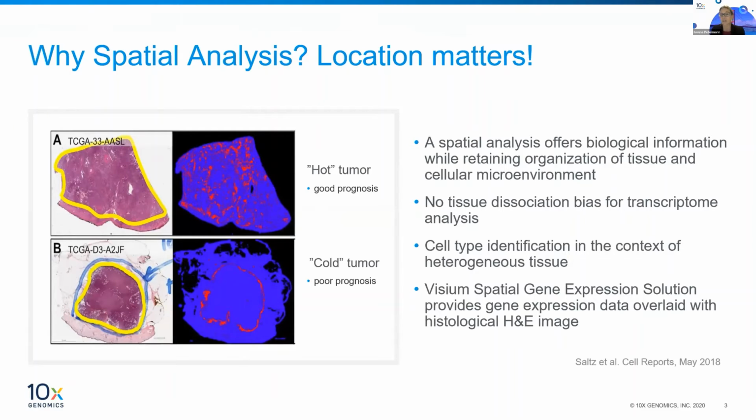And in order to actually track whether that occurs or not, Visium is a really powerful tool to look at this. Here on the top, we are seeing a tumor stained in hematoxylin and eosin on the left, and on the right we are seeing the positive tumor infiltrating lymphocytes, and you can see that they are infiltrating the tumor, which does mean a good prognosis for this particular patient.